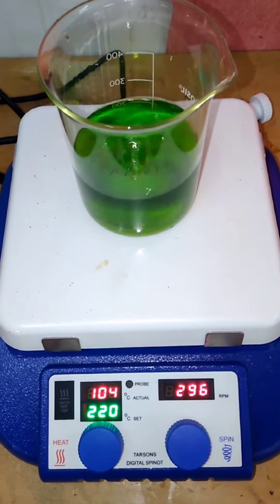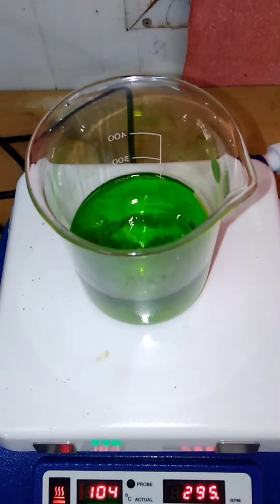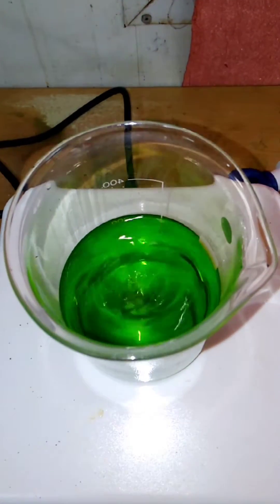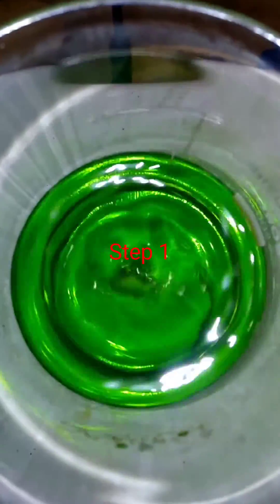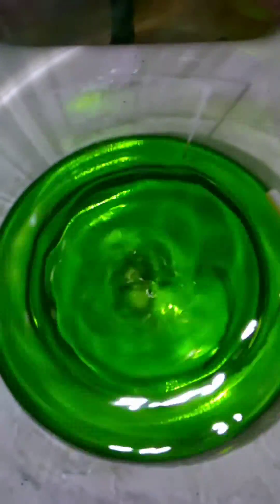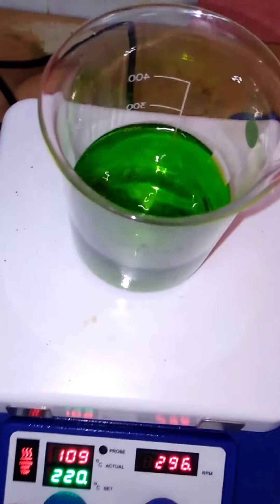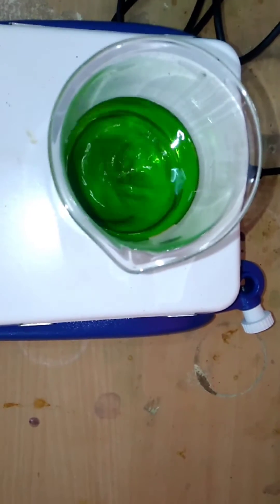Synthesis of nanoparticles by citrate gel method. The compositions are nickel nitrate, iron nitrate, and citric acid. Step one. Step two.